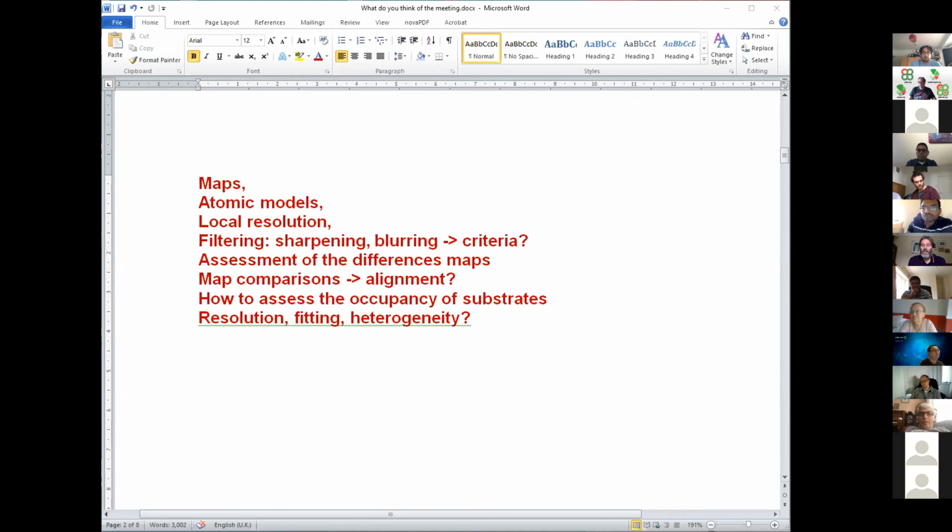Yeah, but the local sharpening is quite important, especially when you look at these ligands, which could be lower occupancy than one. And the RNA can be slightly flexible or something. Yes, absolutely. But the question is whether, for example, the deposited map that you're getting, are we going to ask people to submit extremely local sharpened map? That's one thing they can submit.